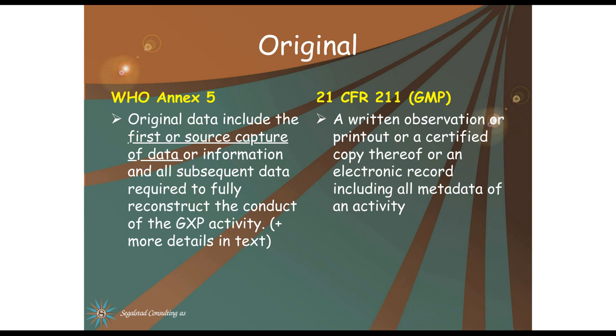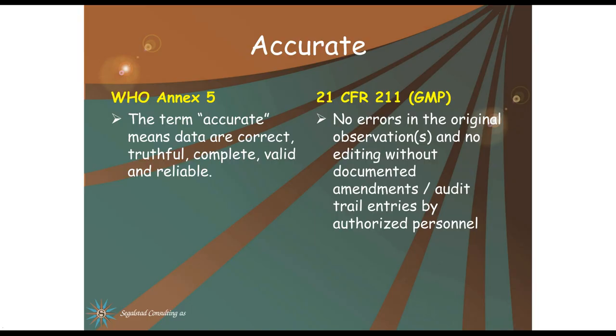Now, this means really that you cannot print out the results, fill in the data in another table, and throw away the printout. Furthermore, you will have to have documentation for all the surrounding data that was needed to get this result. That means that you have to be able to recreate it completely. I'll explain more later which data we're talking about.